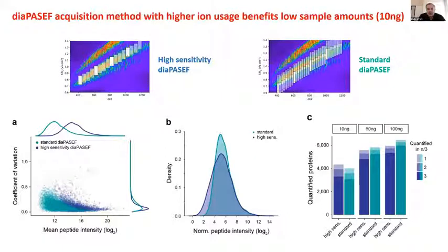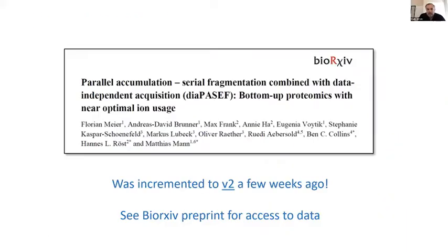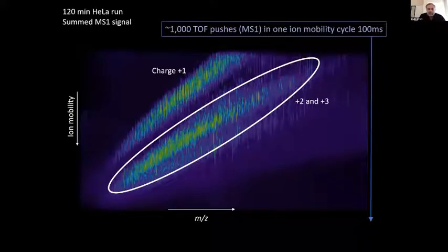Great. So a question here is on the separation of the charge states. The question notes that the 1+ charge states are well resolved, but the 2+ and 3+ tend to come together. And what about the higher charge states? What's factoring into these differences? I don't know if that's completely understood. It's certainly the case that the +2 and the +3 are somewhat mixed. Interestingly, the +3 has a kind of bimodal distribution where one part of it seems to overlap with the +2 and another part of it seems to be slightly away from the +2. And I don't know if it's quite understood why that is.